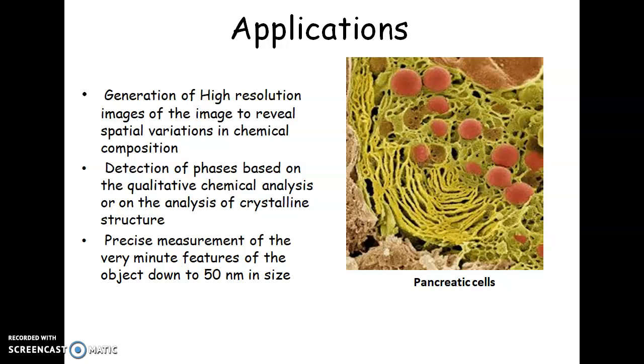Another one is the detection of phases, based upon qualitative chemical analysis or on the analysis of crystalline structure.